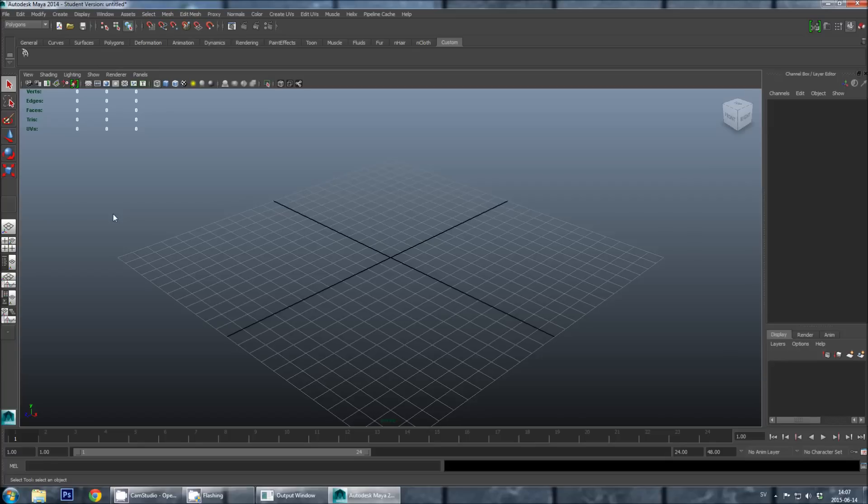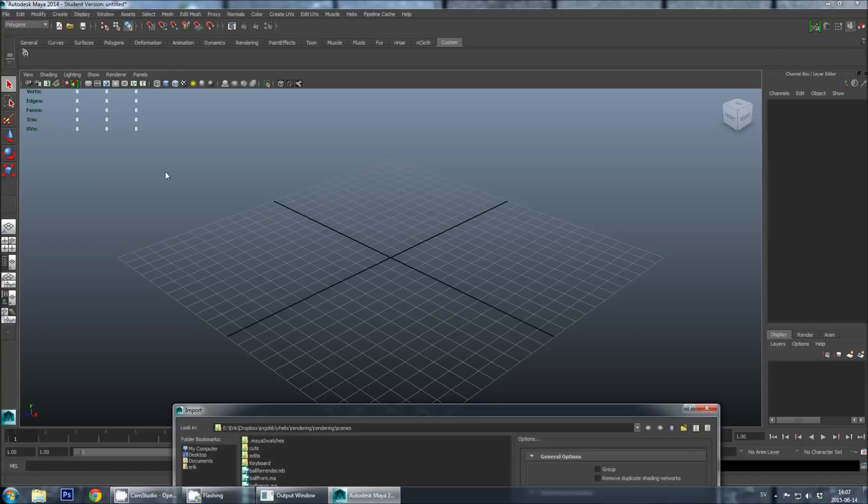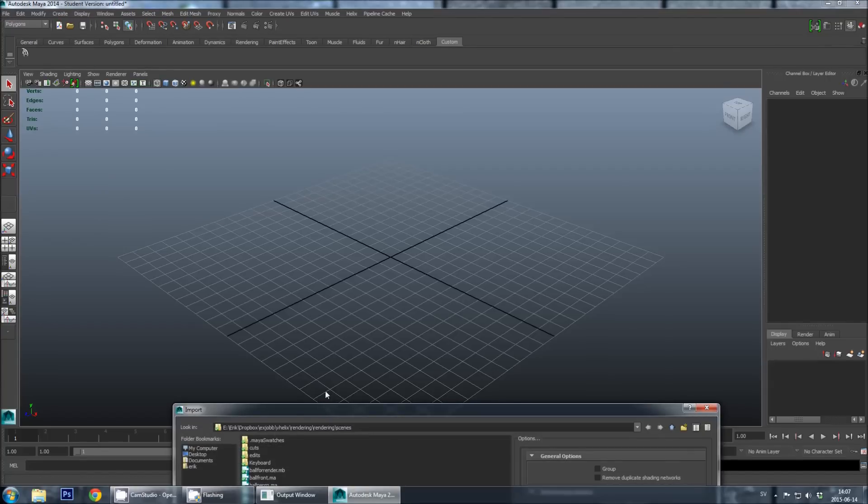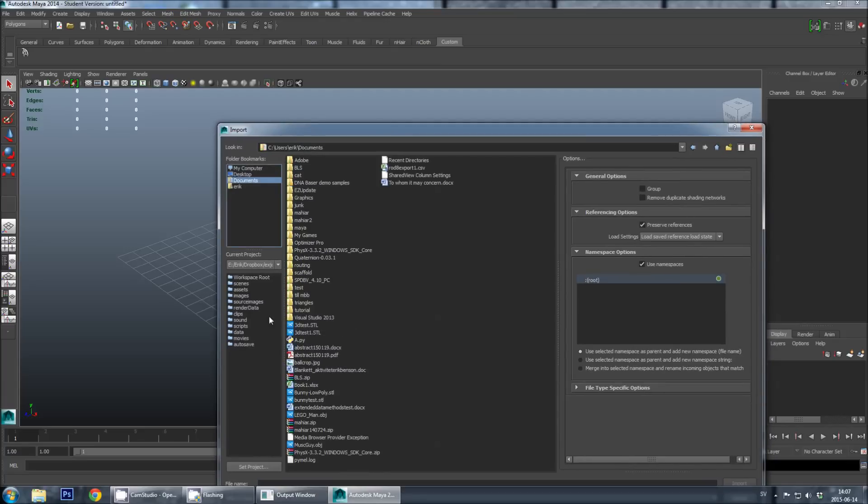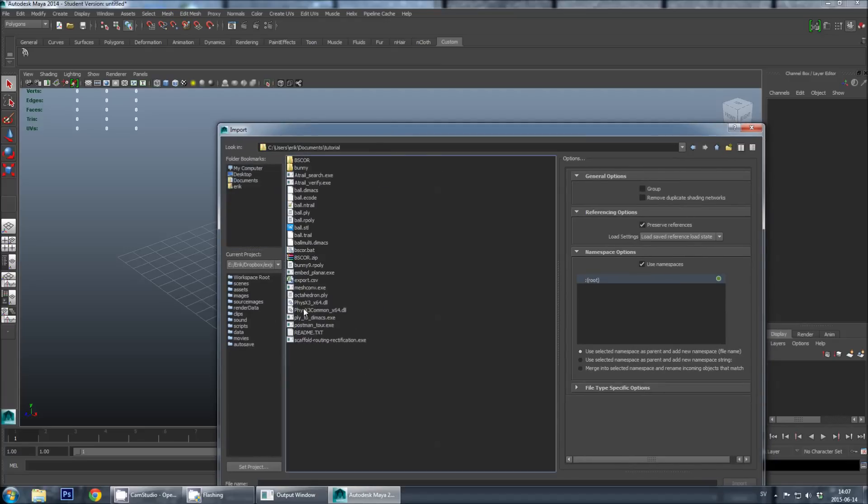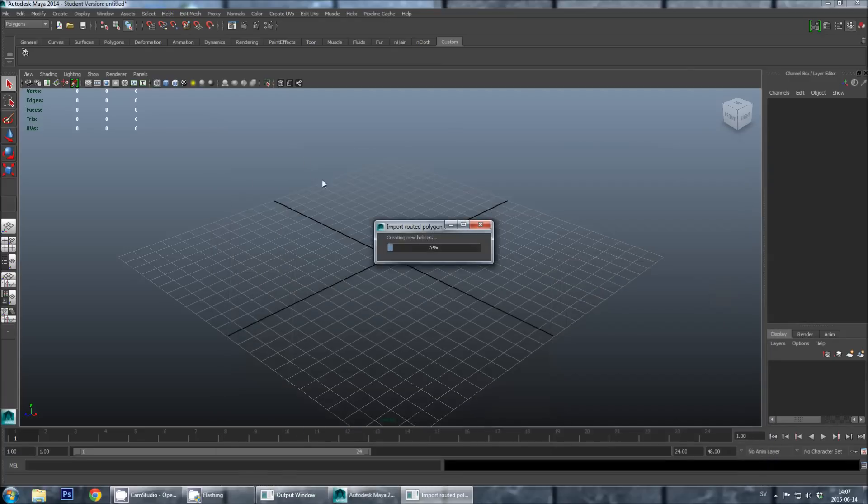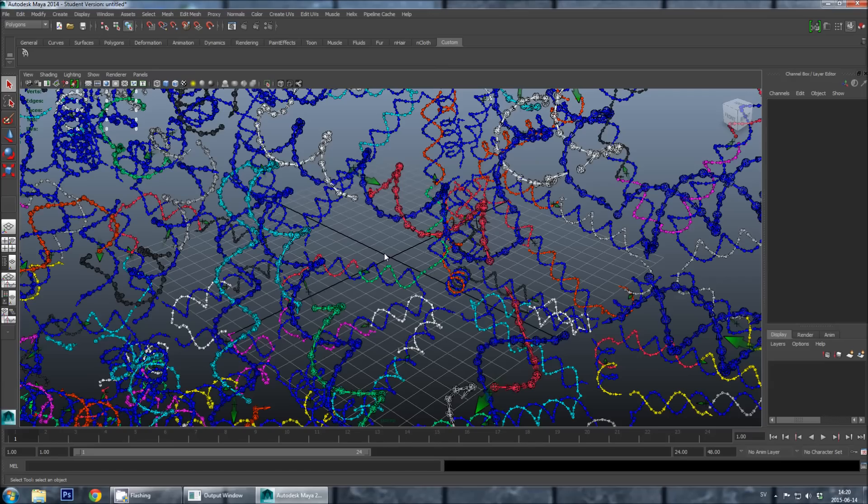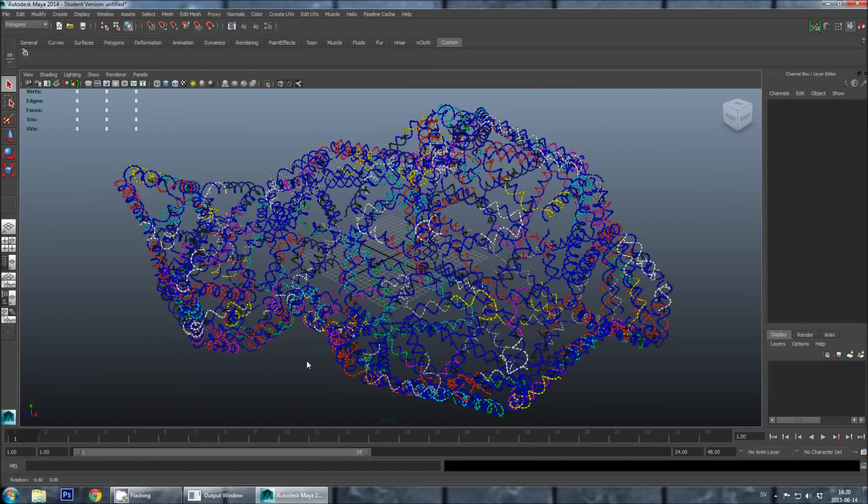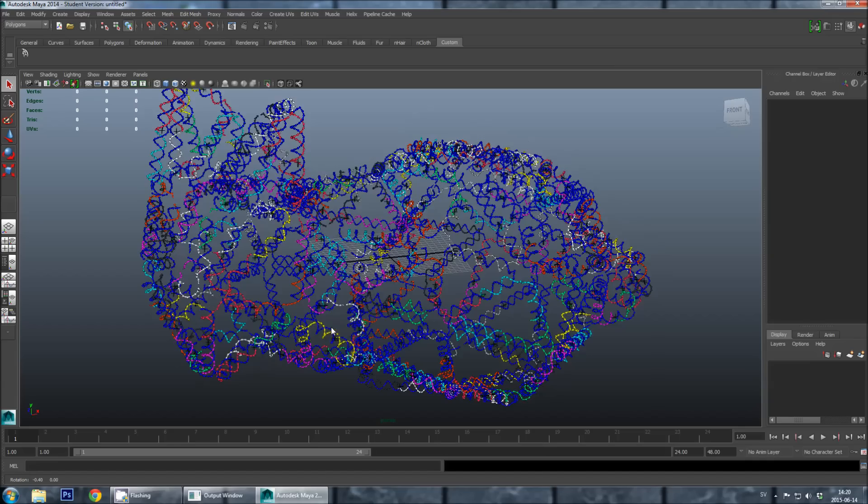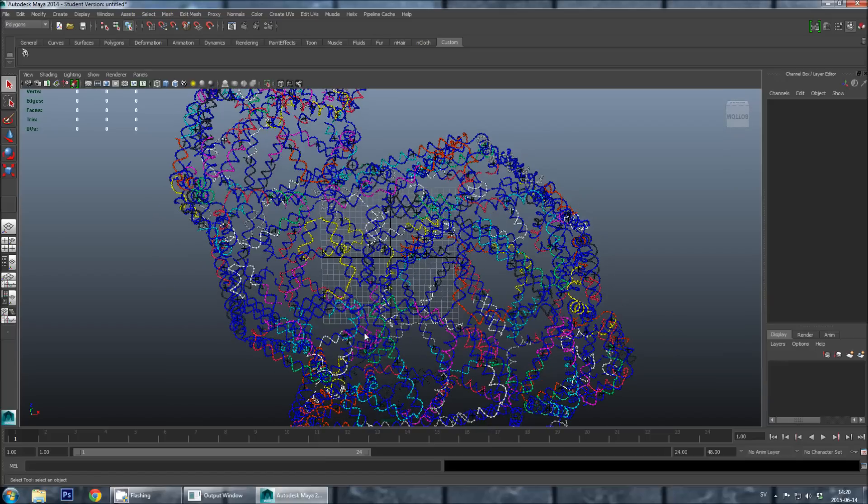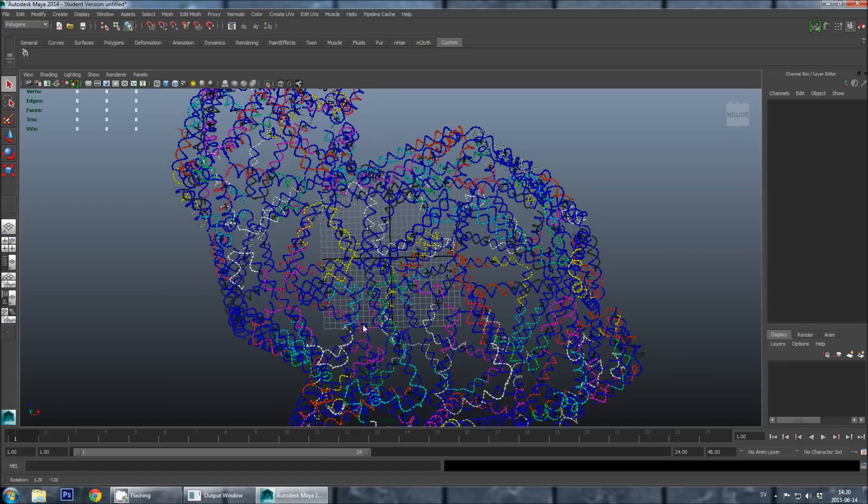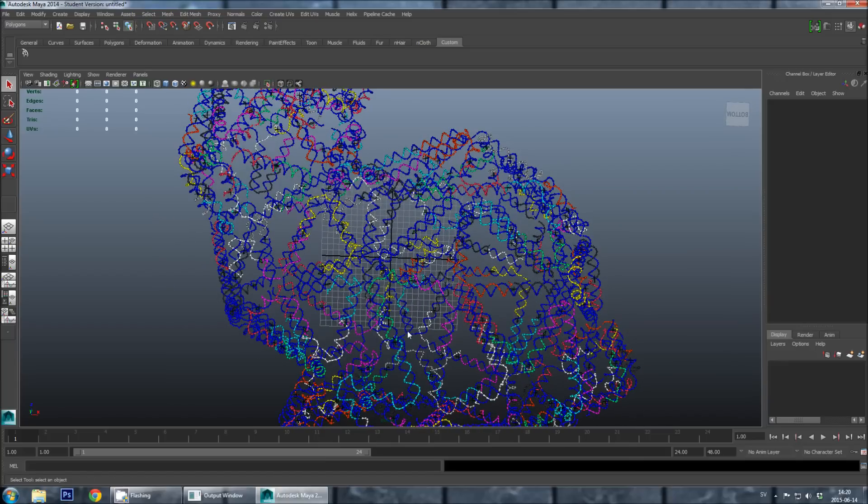I have again started Maya with the V-Helix plugin running, and I will now import a more complex mesh. I have now imported a simplified version of the Stanford bunny into V-Helix.